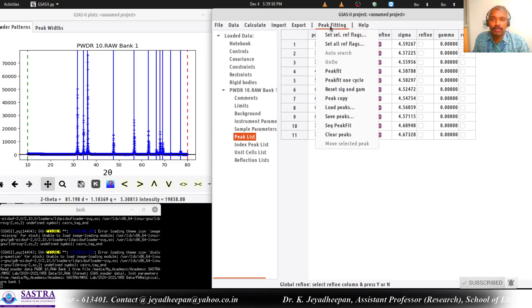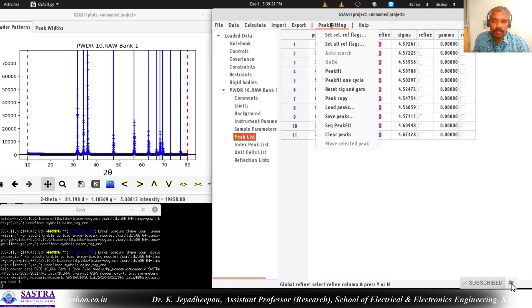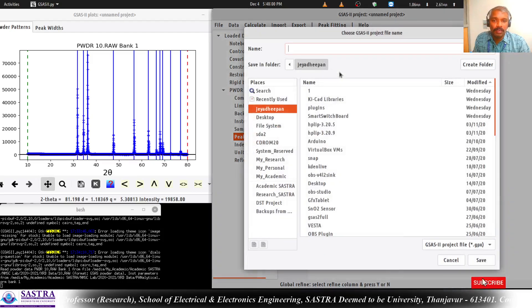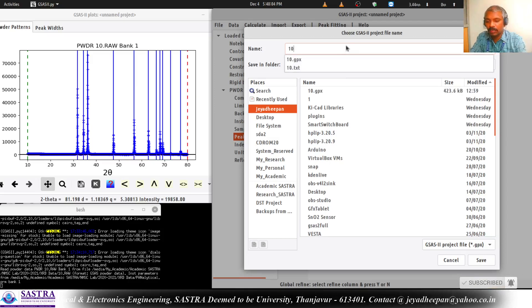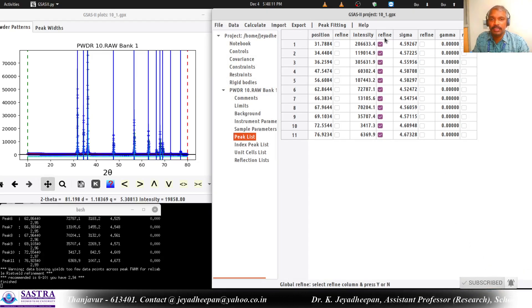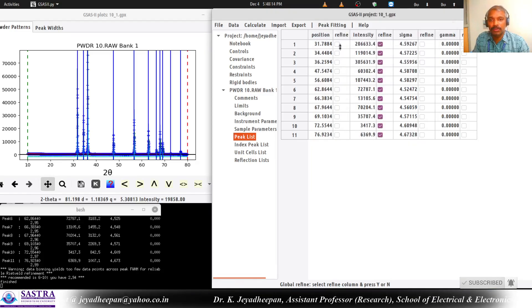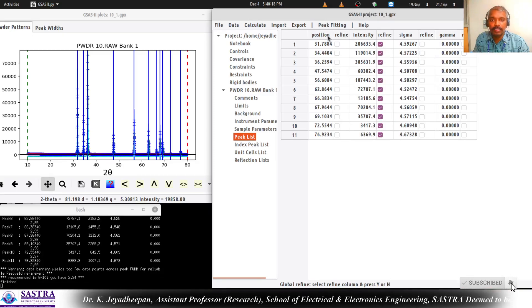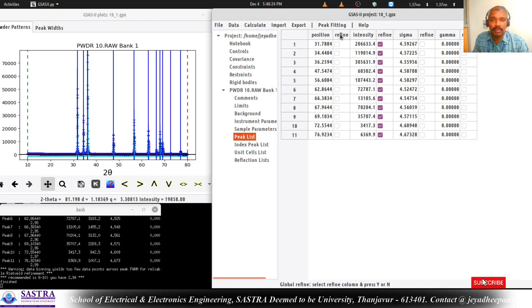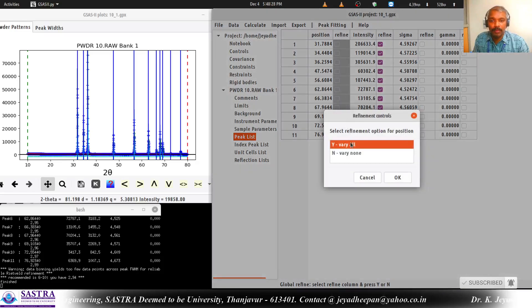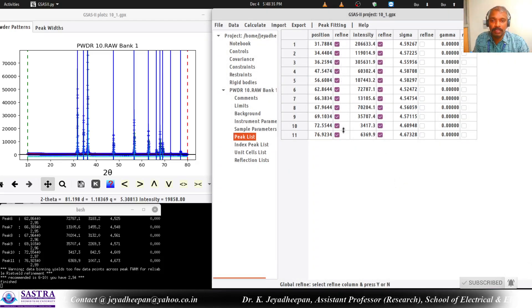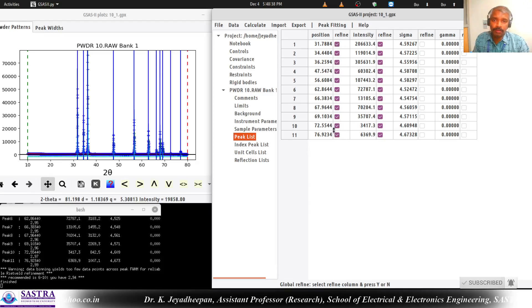To refine the peaks you have to go to Peak Fitting and you will find Peak Fit. Simply press Peak Fit and it will ask you to save the file - I am saving it as 10-1. Now the intensity is refined. You can do it two or three times. Next I am going to refine the peak position. To do that, double-click on top of the refine option and it will ask whether to vary all or vary none. Select Vary All. You will have the peak tick mark over all the peak positions. Now once again you can do the peak fit.